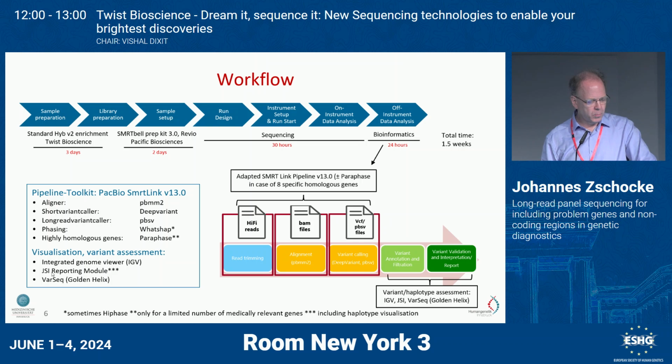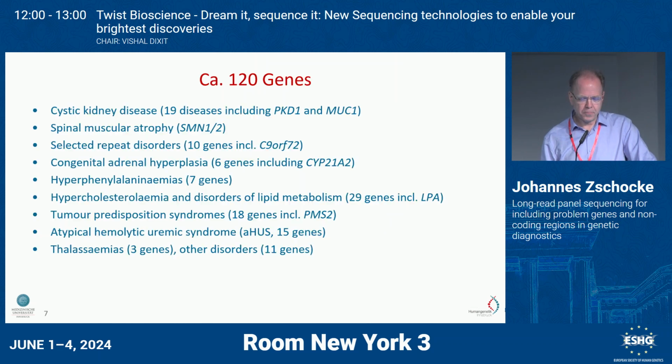There is a phase of a large number of bioinformatics tools which are collected here that we've used, provided by PacBio, and the visualization depends on what you use, and I think there are some nice images that can be generated.